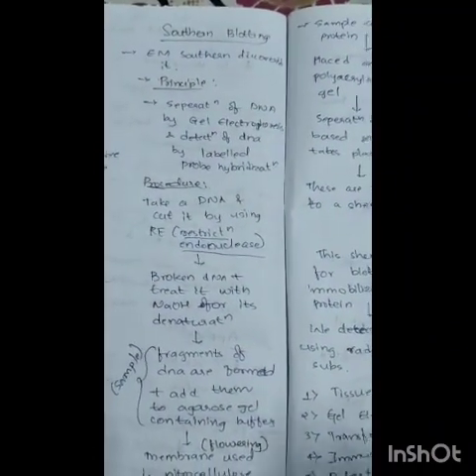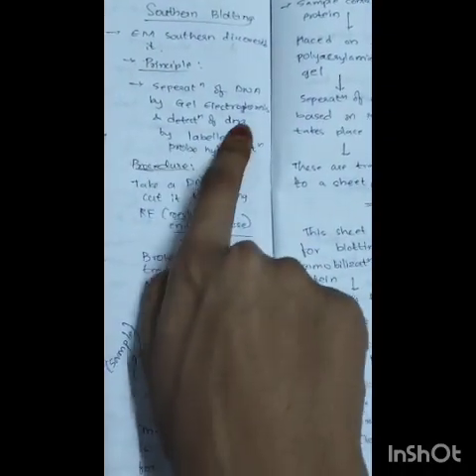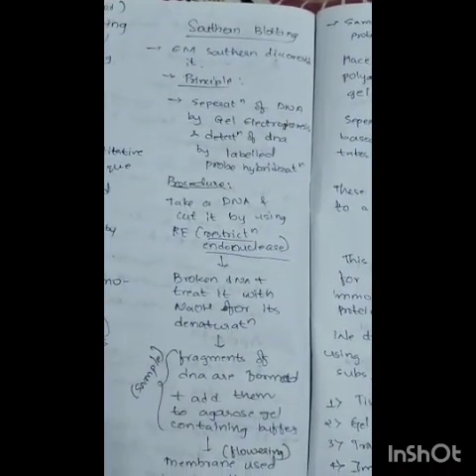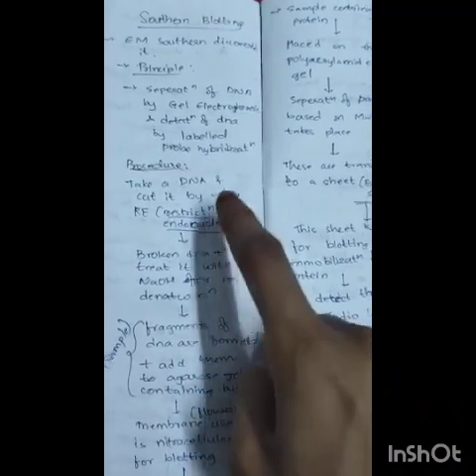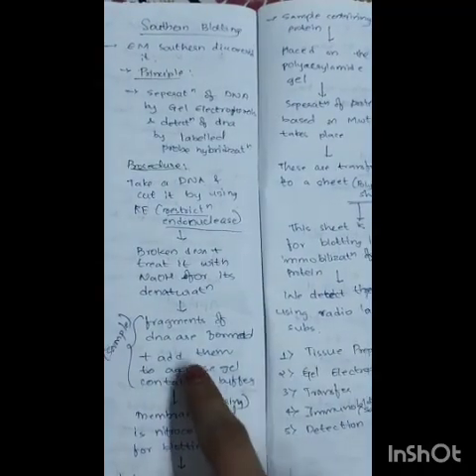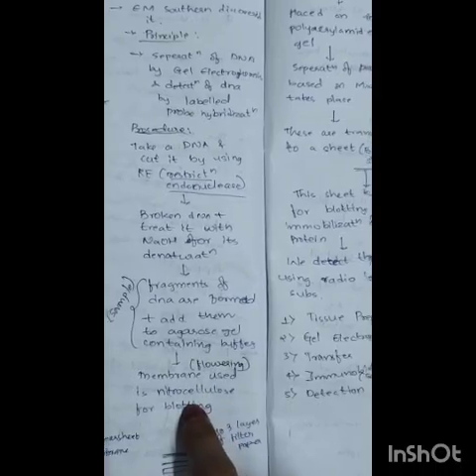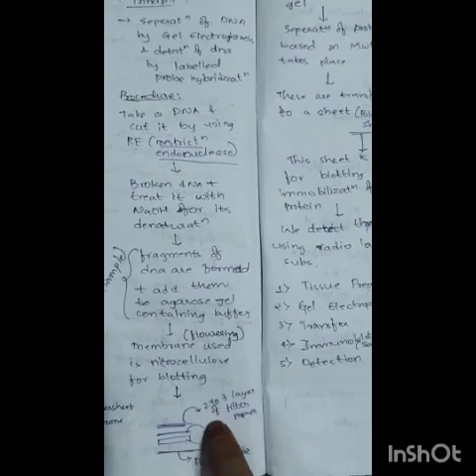We can revise it again. The principle involved is gel electrophoresis and then detection of DNA by labeled probe hybridization. The procedure is: DNA is cut using restriction endonuclease, broken down, treated with NaOH, fragments formed, agarose gel added. Now it is the sample. Blotting is done by flowering using nitrocellulose matrix. The sample moves up but fragments get stuck and they are exposed to cDNA probe, and autoradiography is performed.